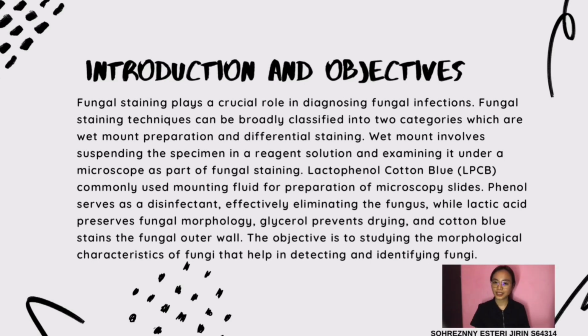Do you ever know about fungus staining technique? Here I will talk about fungus staining technique. It can be broadly categorized into two. First is wet mount preparation, and the second is differential staining. A wet mount is a fungal staining technique performed by suspending the specimen in the reagent solution and observing it under the microscope. LPCB, or lactophenol cotton blue, is commonly used for mounting fungi for preparation of microscopic slides. The phenol acts as the disinfectant and kills the fungus. The lactic acid preserves the fungal morphology. Glycerol prevents the sample from drying, and the cotton blue stains the outer wall of the fungus. The objective of this study is to study the morphological characteristics of fungus that help in detecting and identifying the fungus.